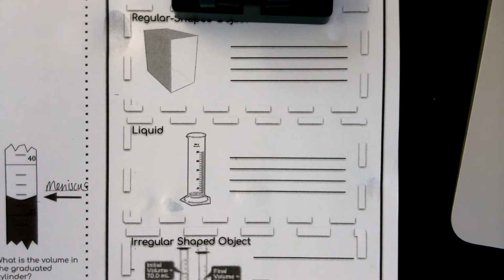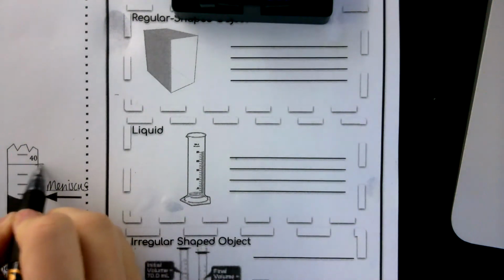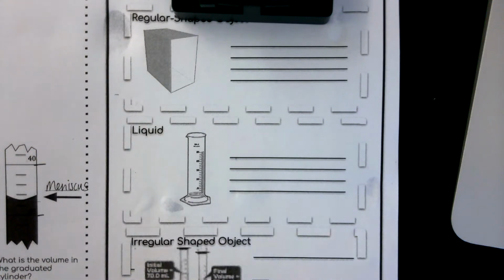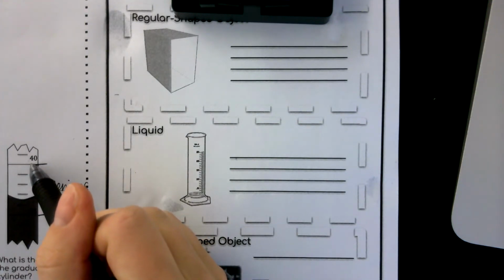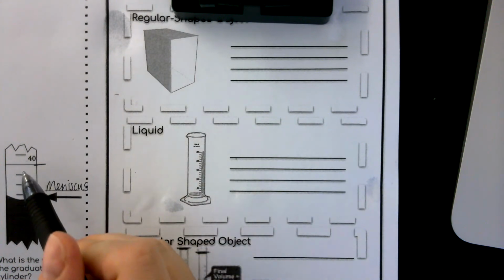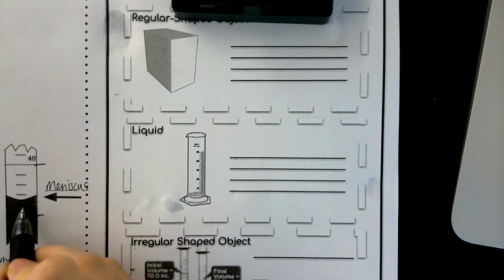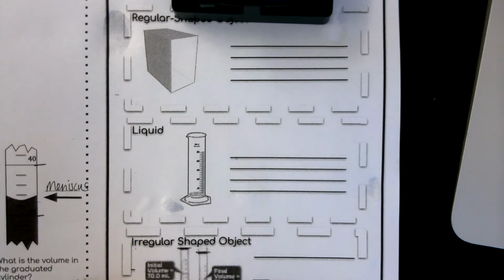Okay, guys, so be careful. Be careful of your rounding. Some of you are rounding too much, okay? So if we look at this, 35 is down here and 40 is up here. And then I have 1, 2, 3, 4 lines in between. So it's 35, 36, 37, 38, 39, and 40. Okay? So each line represents 1, but this meniscus goes to the halfway point. Okay, so it's 36 and a half. 36 and a half milliliters.